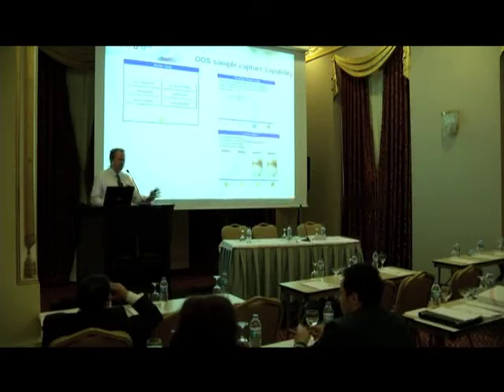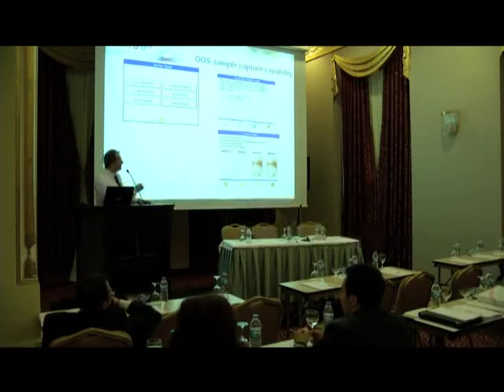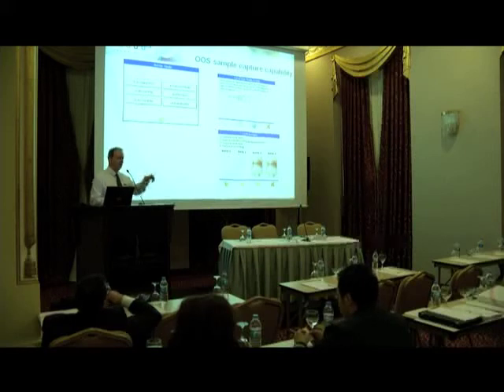And what it will do is you're allowed to enter a TOC limit, which is your alert level. And then what the analyzer will do is if that limit is passed, it will take 2 samples from the water loop straight away into the analyzer. The first one it will analyze again to just check that yes, it is higher than this limit. The second one it saves.